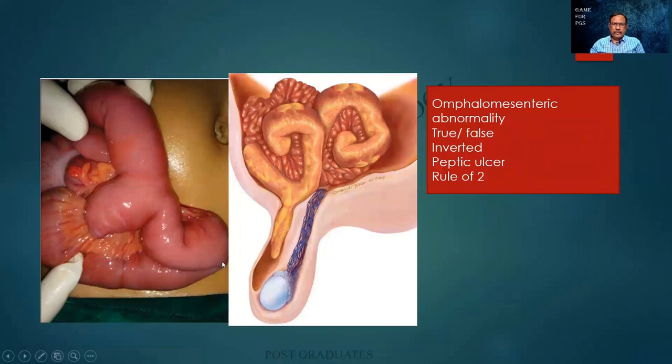Look at this. Another one. Always, somehow, I am not an orderly person. I tend to divert or deviate. So there is a diverticulum. What is a diverticulum? A diverticulum is nothing but a deviation. In fact, you can say the appendix itself is a diverticulum. So in this case, I find that there is an intestine and then part of it is getting diverted out. It happens to have a blunt end.